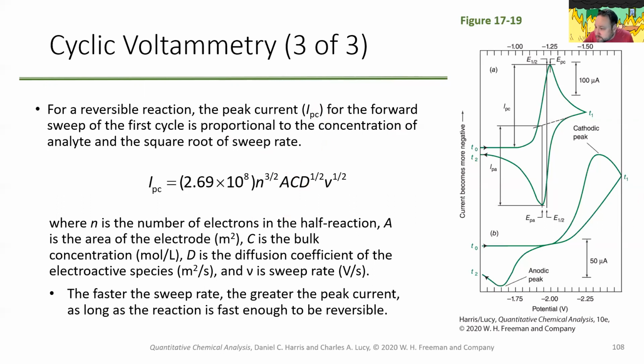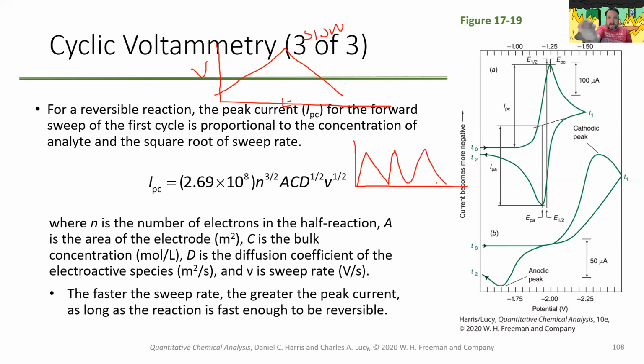So let's say I've got two voltage profiles. I've got a slow one that's really slow, and then I've got another one where I'm going to go fast. Same magnitude, but in one case I'm going to switch the knob real fast. You would think, on a gut intuitive level, that slowly changing that thing would be better. But what we see in the actual cyclic voltammogram is that we might get a little one for this guy, whereas in this one we would get a much bigger response.